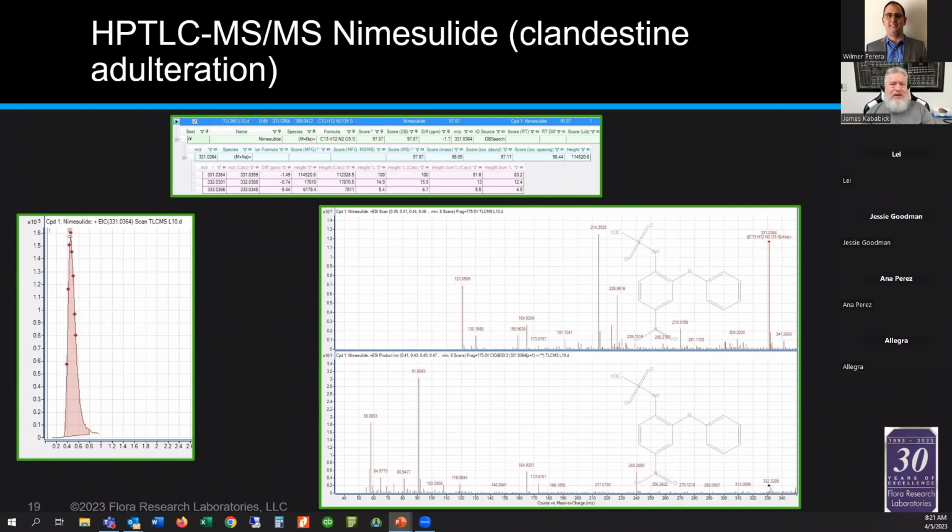Again, if you don't want to desorb into mass spec, you could desorb into a vial and then take that sample and transfer it for NMR or for FTIR or for further chemical test, or a secondary planar chromatography method or HPLC, whatever you'd like to do. It's a very fast technique and very easy to do.